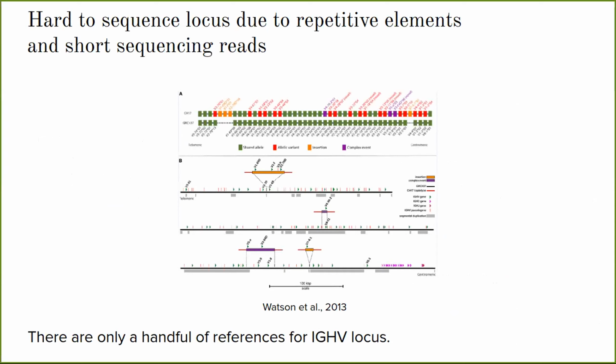The IG chromosome is quite hard to sequence due to a lot of repetitive sequences within it, and it's also quite hard to map back to the full chromosome. So using the Immcantation tools and the data sets we acquired, we try to complete the picture and see what genes and alleles we have in the chromosomes, and also how they align on each of the parental chromosomes.